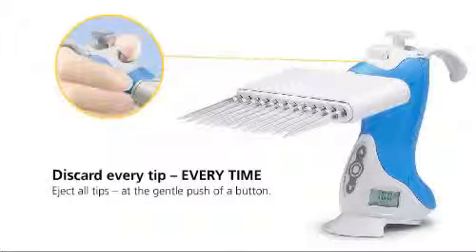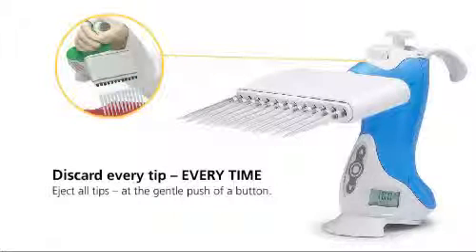And when the pipetting cycle is complete, a gentle push on the tip eject button discards all tips simultaneously, without effort. All tips, every time.